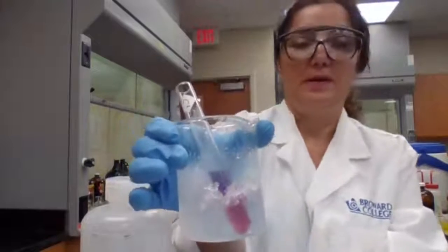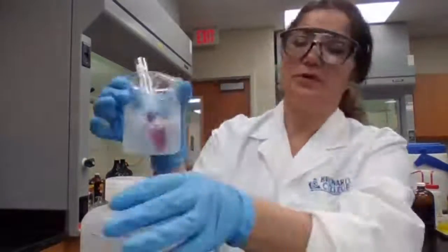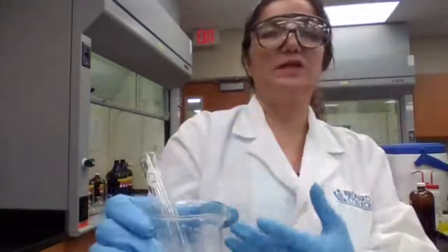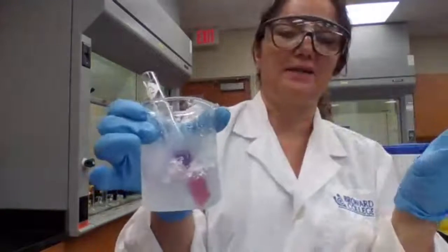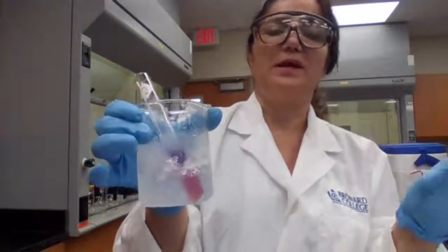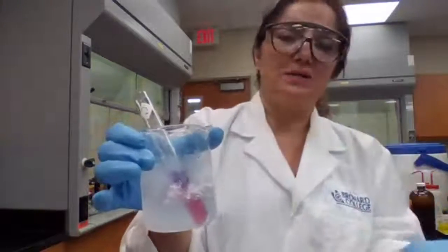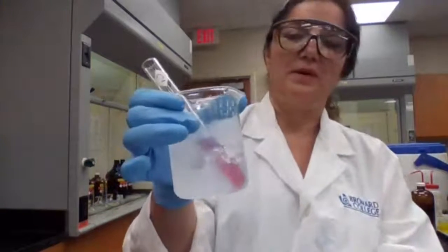And if it stays in the ice bath long enough, everything is going to be changing color. When I was talking about exothermic and endothermic, you lower the temperature, it changes to one side. You increase the temperature, it changes to the other side. Looking at the balanced equations that you have, because it gives you the colors, we say if it's shifting to the right or to the left, and you can decide if this reaction is exothermic or endothermic.